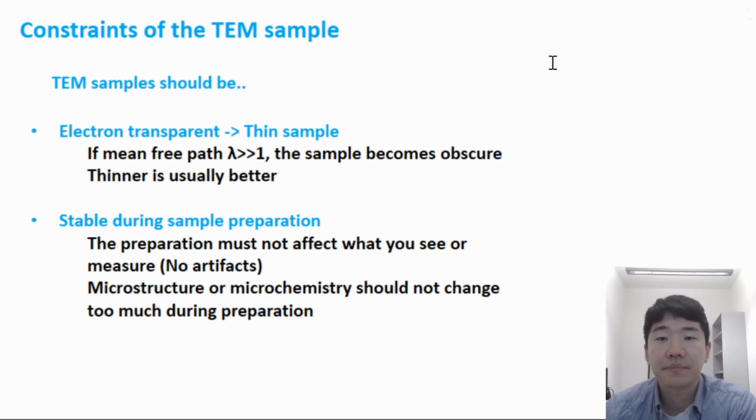Of course, it is a function of the mean free path of electrons in the sample. For high resolution TEM or electron spectroscopy measurement, a sample thickness of less than 50 nanometers or even less than 10 nanometers is required. But these restrictions get reduced as the beam voltage increases, but the increase of the beam voltage can cause damage in the specimens and may create some artifacts during the measurement.